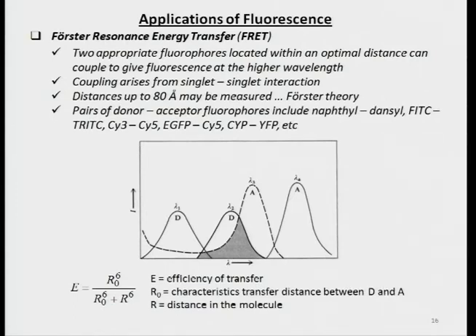Cyan fluorescent protein and yellow fluorescent protein. These are the newer systems that you can actually engineer, you can actually express. So you can not only do this on a molecular level, single cuvette level, but obviously this is heavily utilized in cellular assays these days.